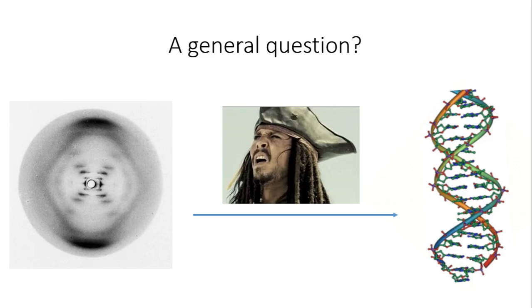So early students, or you can say the starting students who start out with structural biology, don't usually appreciate how we reach from a diffraction pattern to a three-dimensional model. And I am delivering this lecture just to fill up this gap. So in this lecture we would try to fill up this gap as to how we end up with the 3D model if we start out with this diffraction pattern. Okay, so we would try to answer this question.